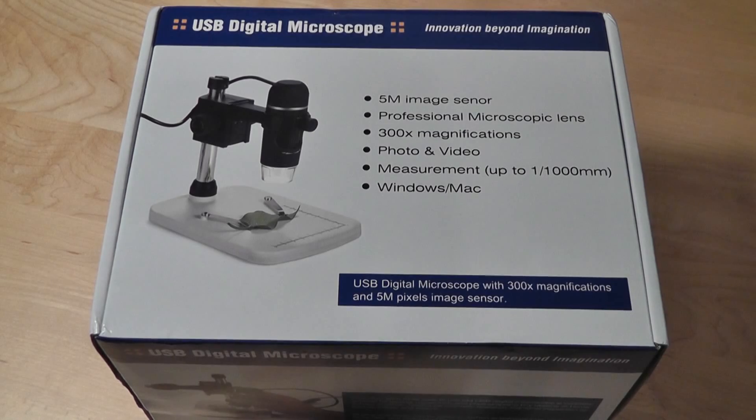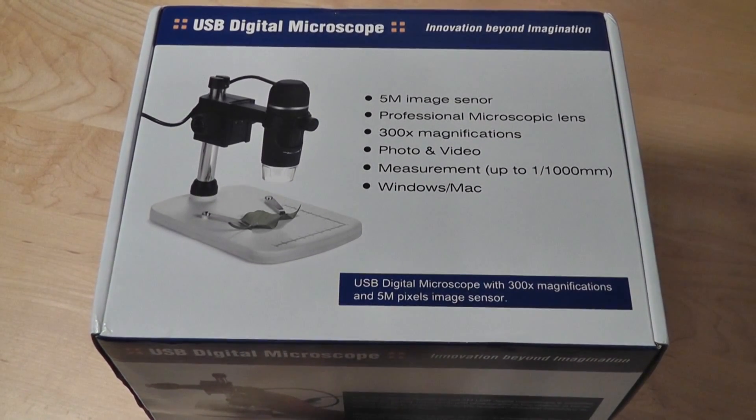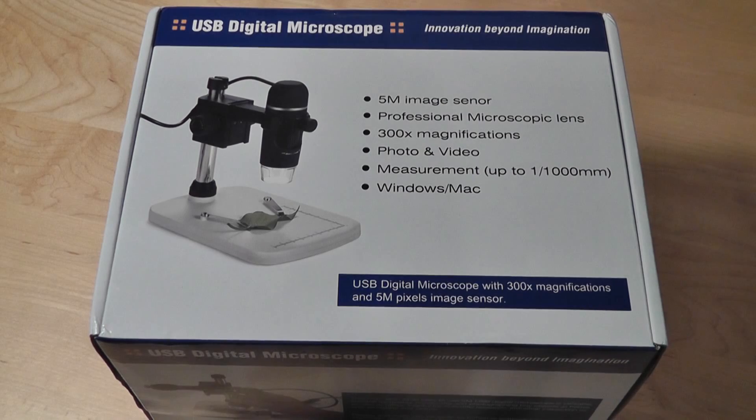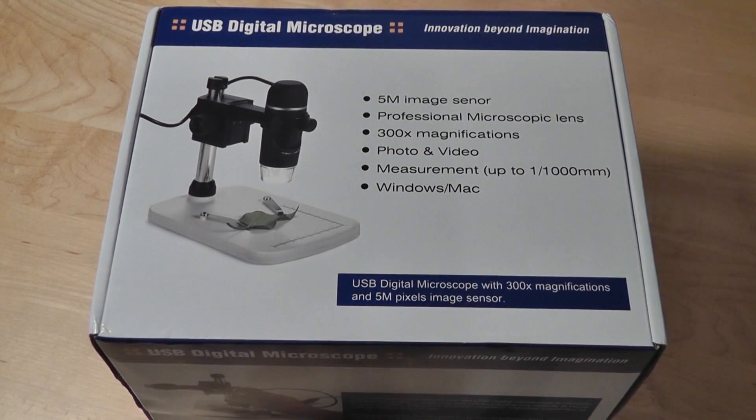Hey folks, here at OSReviews you're watching our video review of the DB Power USB Digital Microscope. This is going to be great for those of you who love to do some experimentation in the house, or it's also pretty good for labs and general school usage in high schools. It's a modern-made microscope instead of a traditional one, so you can actually capture and record whatever is happening on the device by capturing it using the program installed on your computer.